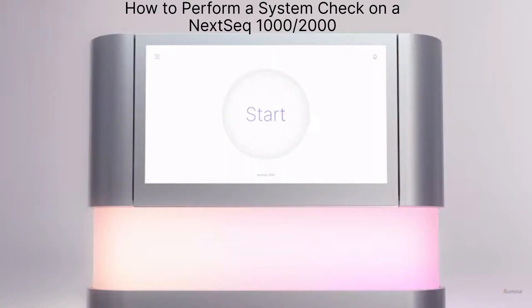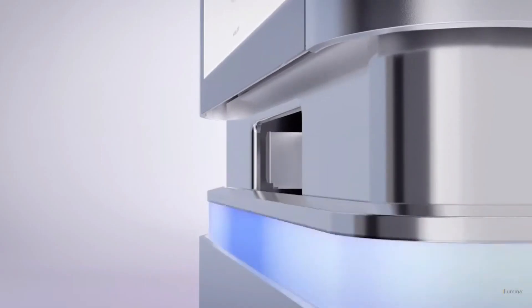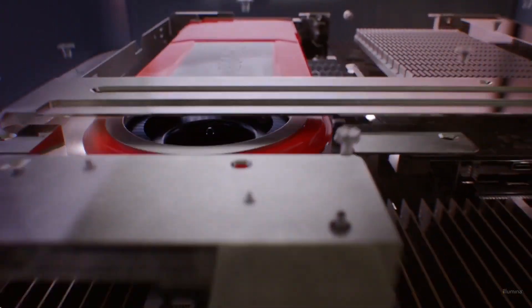How to perform a system check on the NexSeq 1000 and 2000. The system check helps to confirm that four instrument subsystems are functional and properly aligned.